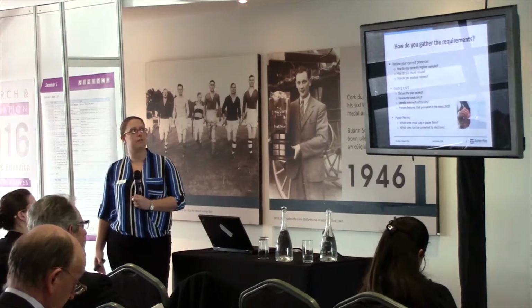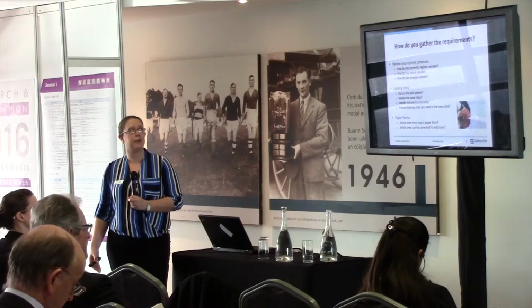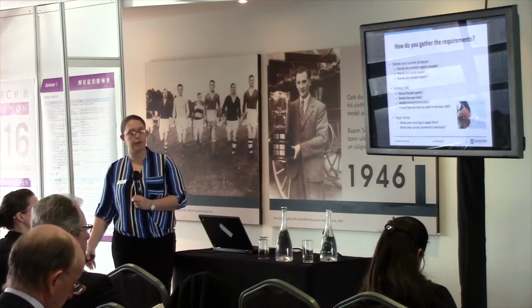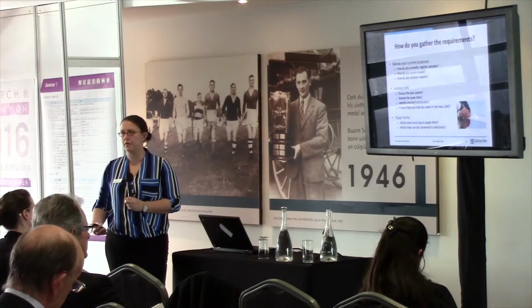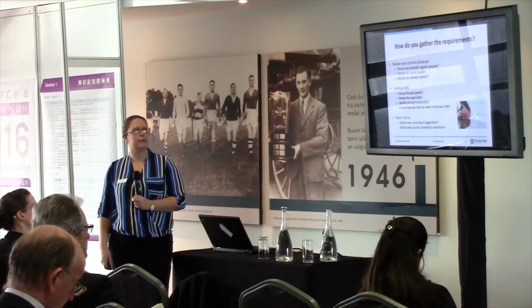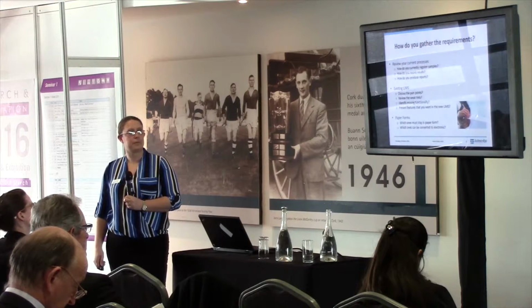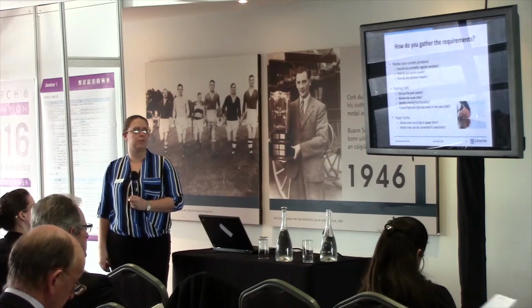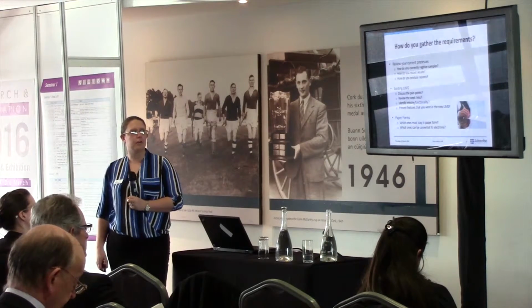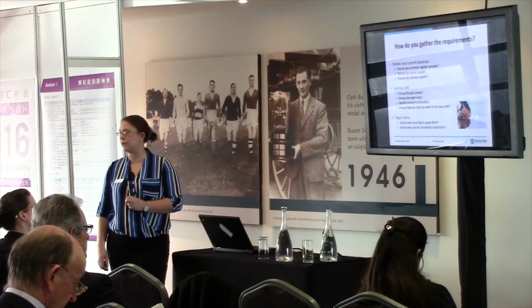So how do you currently register them? How do you record the results? What reports do you need out of it? If you've got a LIMS system already, what causes you problems? Review the weak links. Present the features that you want in your new LIMS system. And again, you've got down the bottom there, paper form. So do you want some reports to still be in paper form, or is everything going to be electronic now?